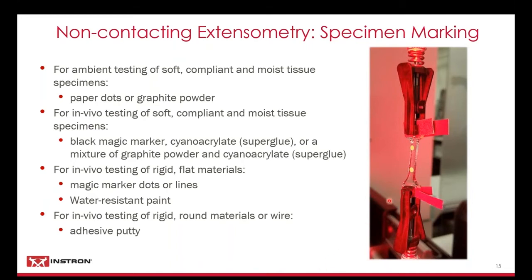This image shows a hydrogel specimen that's actually being held between pieces of paper so it doesn't slip on the little small spring-loaded grips. These are 5-Newton grips, and we've got 2 white dots that the video extensometer would be tracking.